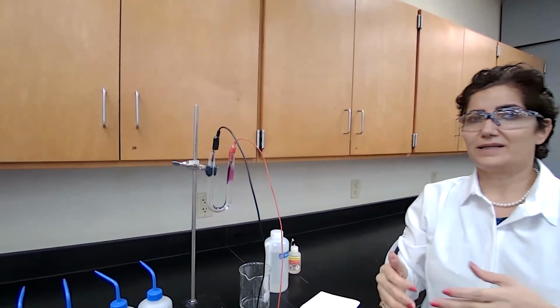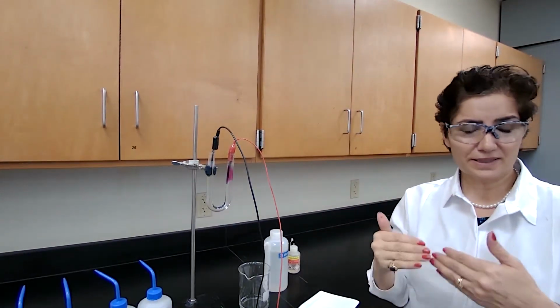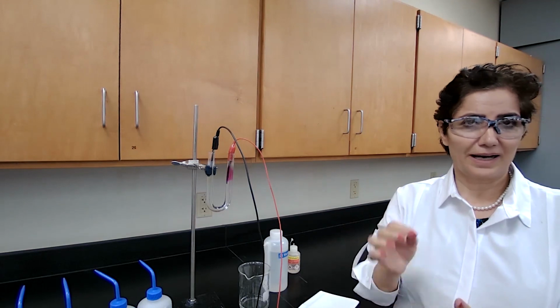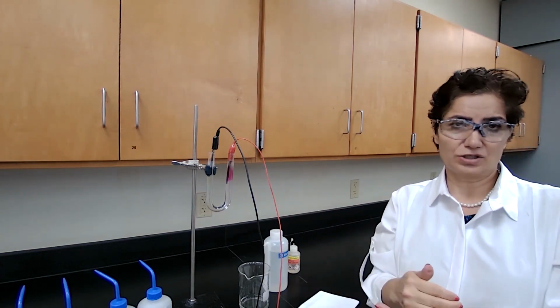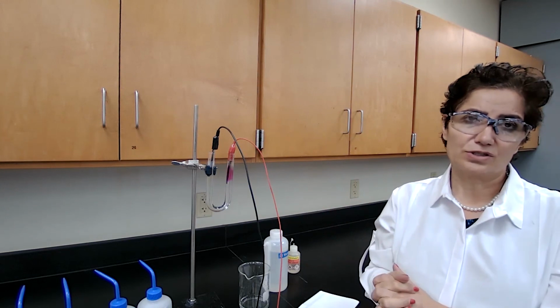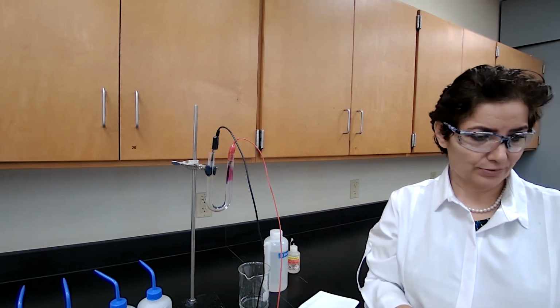Do not write just that it turned red or it turned yellow. Please include, if the pink color appeared, what it actually means, and write the half reaction for each oxidation and reduction. Oxidation happens at the anode, reduction happens at the cathode. So make sure that you write the half reactions properly. Thank you.